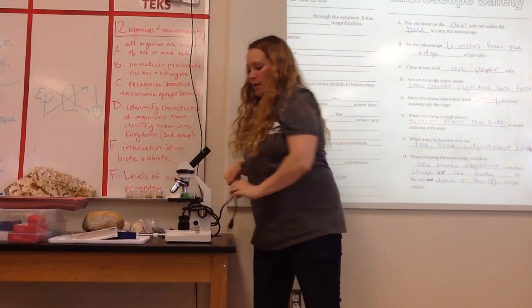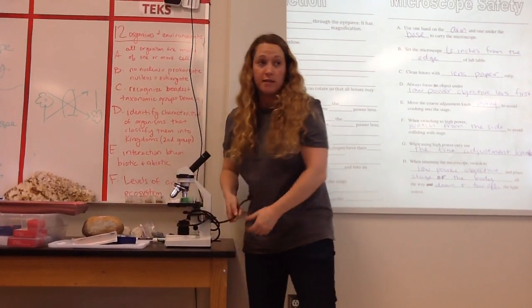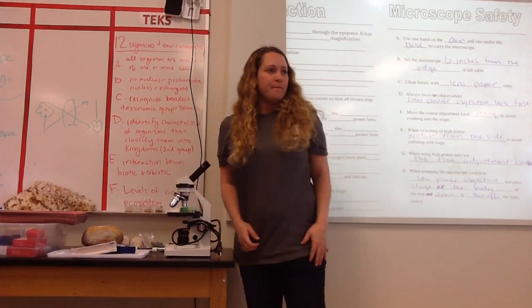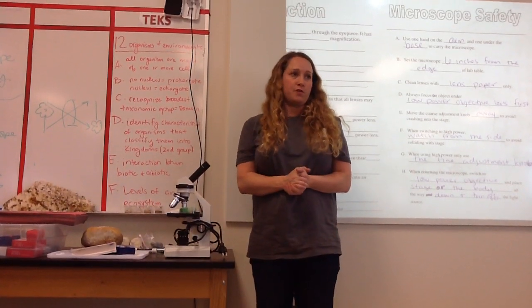Usually a microscope has a nice cover so that dust doesn't get on the lenses and you have to clean it every time you use it. So keep it clean and you won't have to do that. So any questions on how to use the microscope? Yes, ma'am.